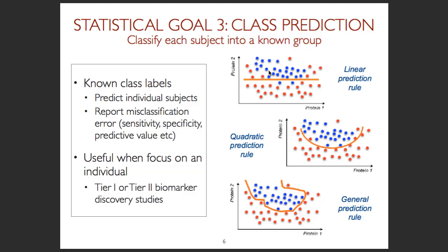So what we can also do now is to have a different approach where we use both protein 1 and 2 and have a more complicated decision rule which involves both proteins. Now we see that we do not misclassify as many red points, but we misclassify some. Or we can have a very, very complicated decision rule, which now does not misclassify any of the data points in our study. But chances are that this accommodates too much some random artifacts or some variability which is not really systematic variability due to the disease. So this is likely too close to the individual points. This is likely too simple. So maybe this is a little bit more complex, but not too complex. These methods will be looking for this type of decision boundaries to use as few proteins as possible and as simple rules as possible, but to provide a good discrimination between health and disease.